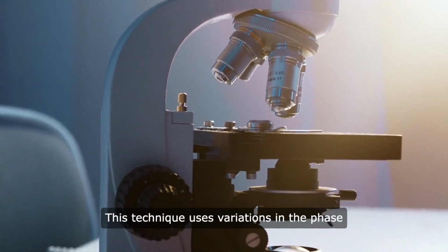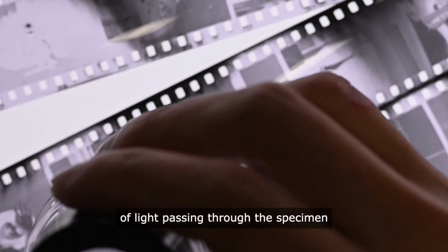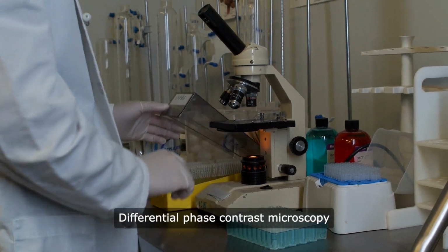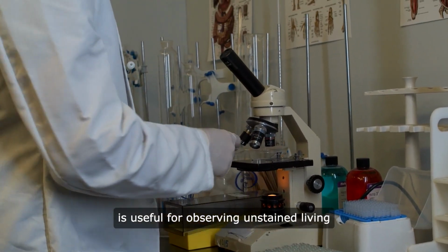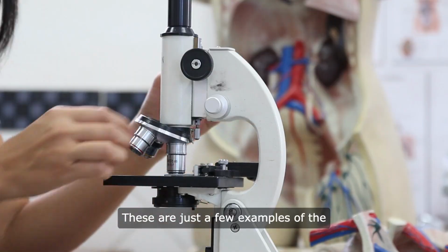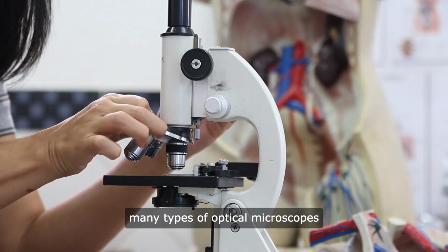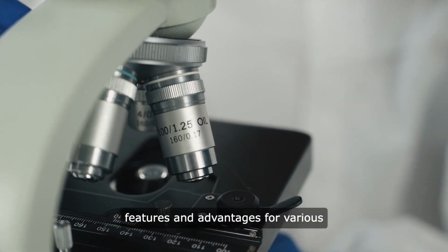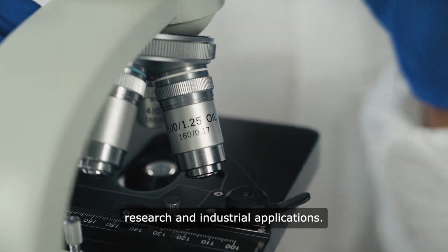This technique uses variations in the phase of light passing through the specimen to produce high-contrast images. Differential phase contrast microscopy is useful for observing unstained living cells and thin biological specimens. These are just a few examples of the many types of optical microscopes available, each offering unique features and advantages for various research and industrial applications.